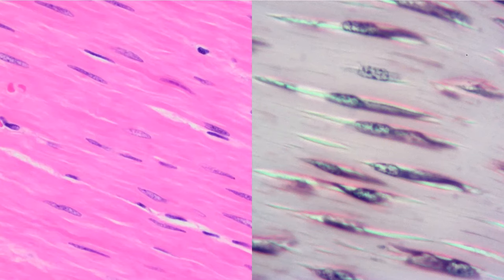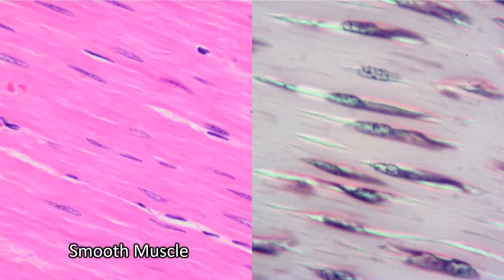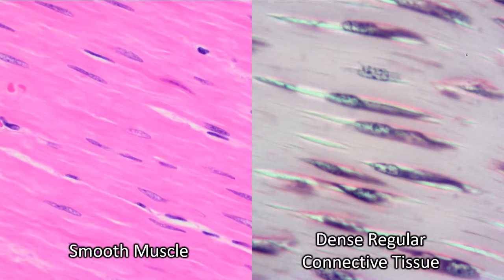On the left, we have smooth muscle, and on the right is dense regular connective tissue. At first glance, these slides might seem very similar.